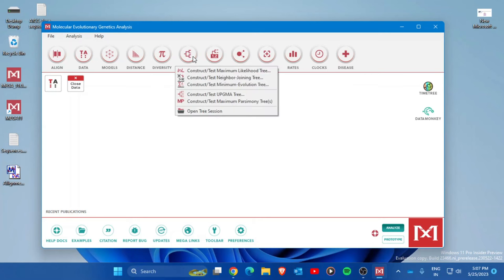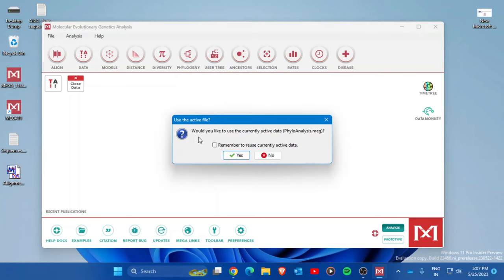Now go to the Phylogeny option and choose 'Neighbor Joining Tree'. There are multiple tree options available, but for 16S rRNA gene sequences, the general practice among microbiologists is to use the Neighbor Joining tree. It will ask if you want to use the currently active data — press Yes.